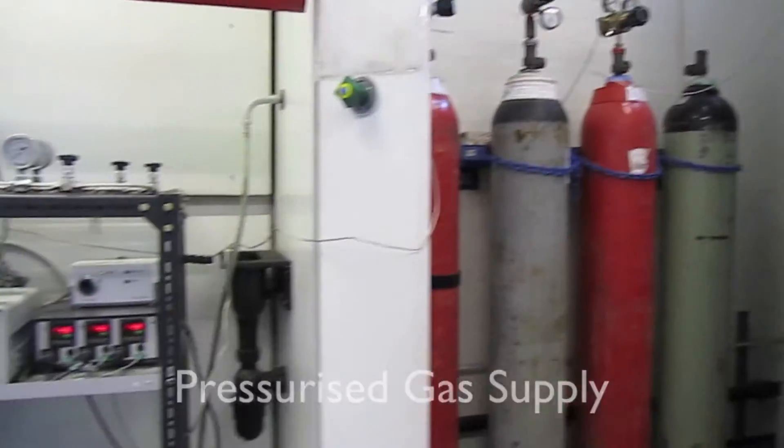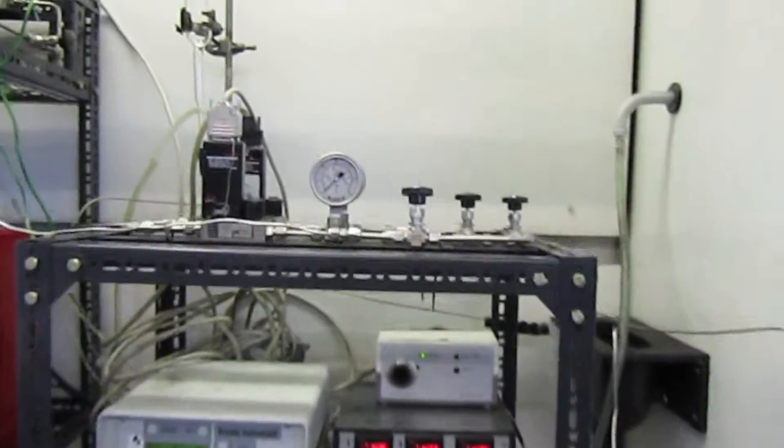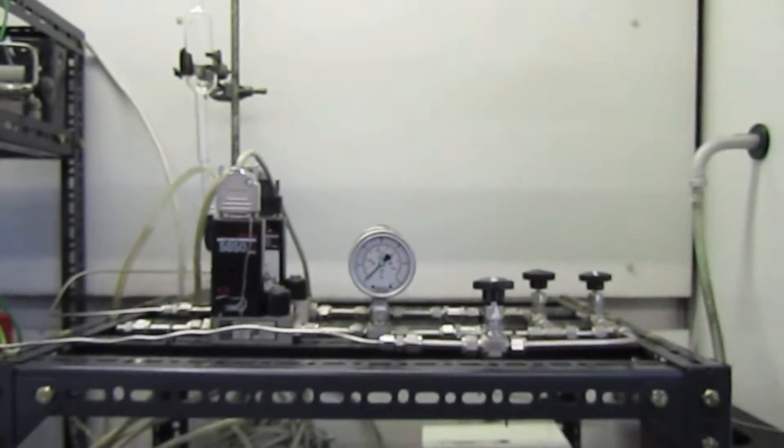The flow of gas is regulated by a mass flow controller which controls the flow in the range of 3 to 30 litres per hour.